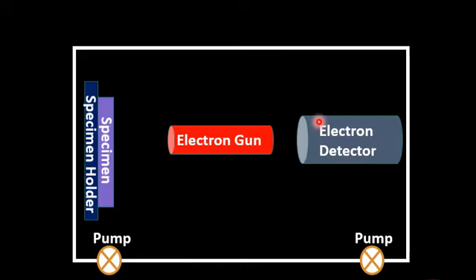So you can understand the structure and design of the cylindrical mirror Auger electron analyzer in my other lectures. Watch those lectures for understanding the internal design of the cylindrical mirror shaped Auger electron detector.